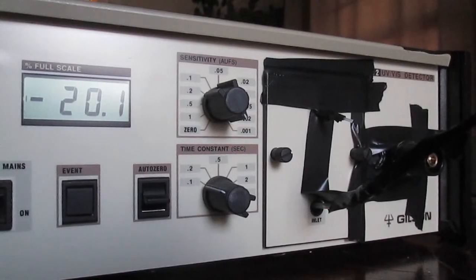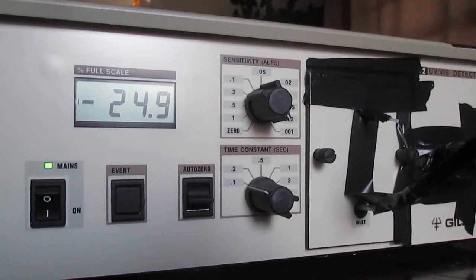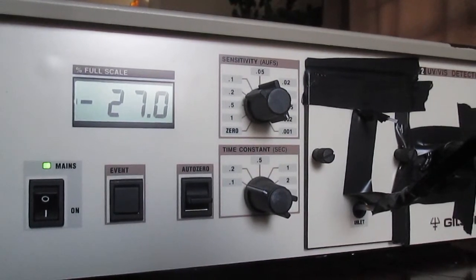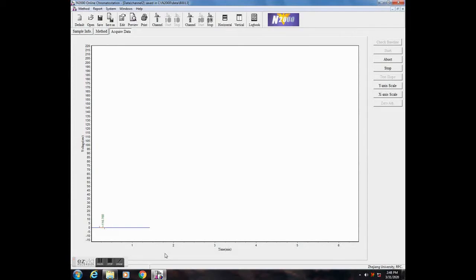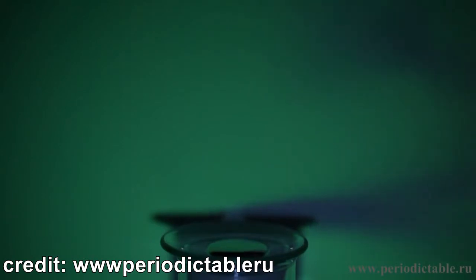This is an older UV absorbance spectrophotometer that operates on two wavelengths: 254 and 214 nanometers, and that thing is quite sensitive — you can look at it funny and you'll get a signal. Mercury vapors can be detected at the 253.7 nanometer wavelength at which it absorbs light.